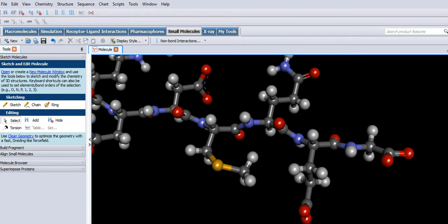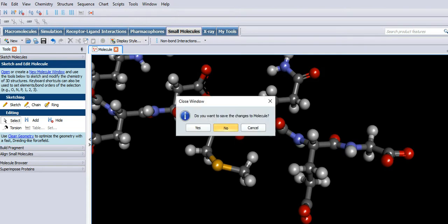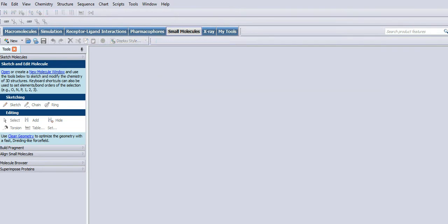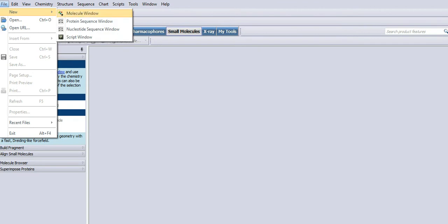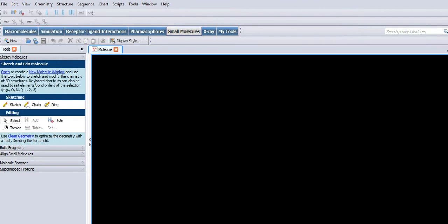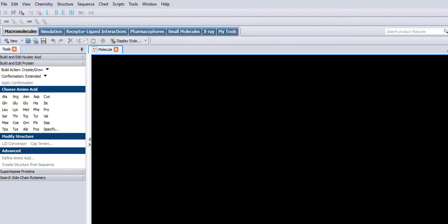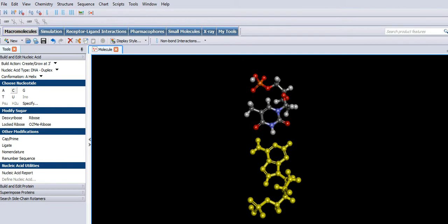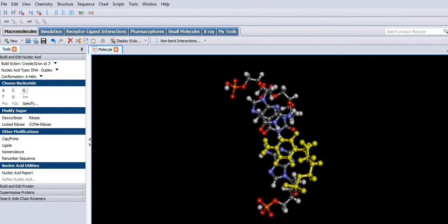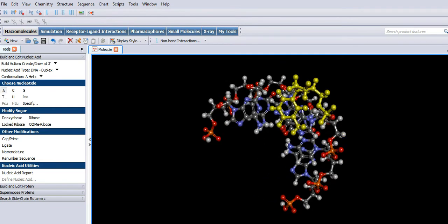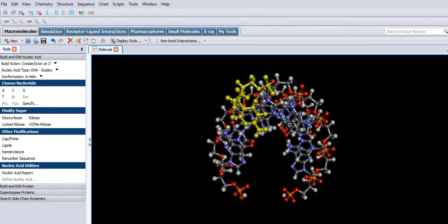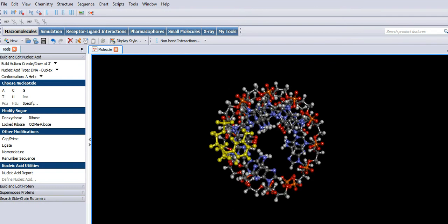Okay, close that down. Now a quick look, very quick look at polynucleotides. Macromolecules, nucleic acid: A, C, G, T, A, C, G, T. Back to small molecules.